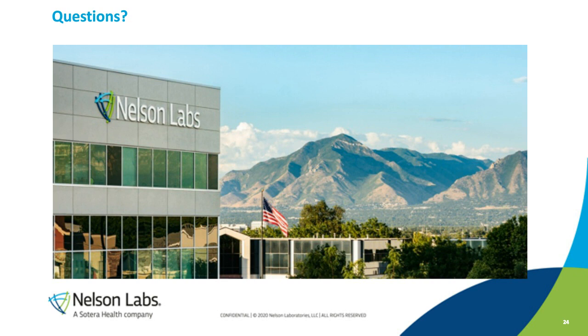Well, Johan, I think that's an awesome question and an interesting analytical problem. So the short answer is that I don't really know, but certainly I can speculate on a couple of things. One thing I would say is that when you run TOC on a titanium implant, TOC is only compatible with water. So you extract the titanium device in water, and then that water gets analyzed. All the organic stuff is oxidized, and you measure the total amount of carbon in the water.